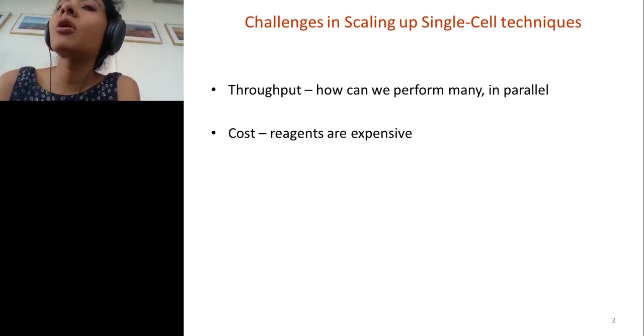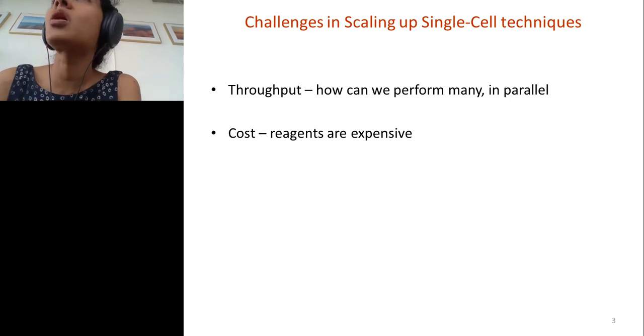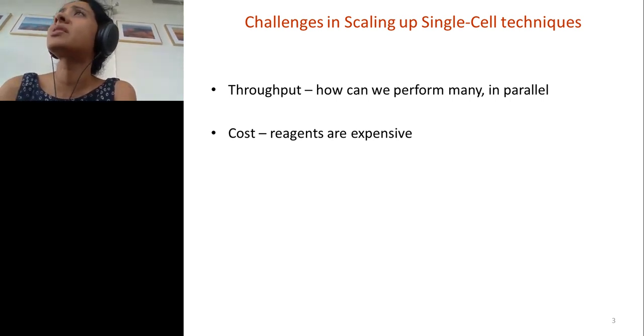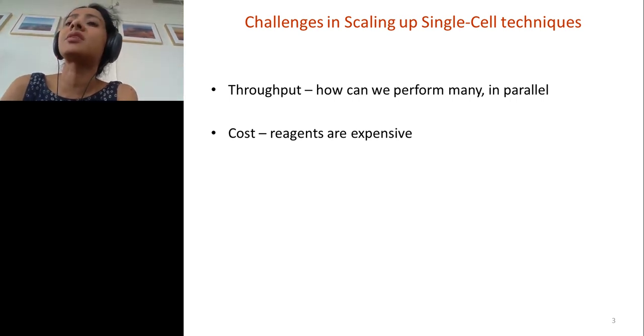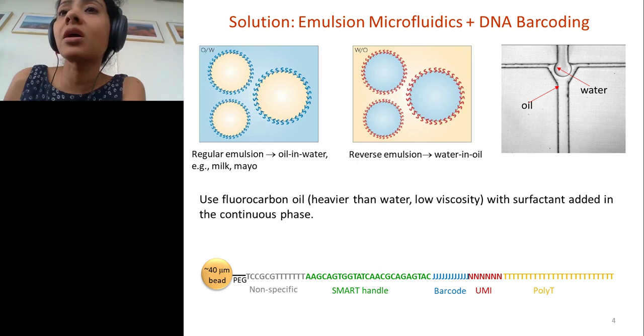We are all aware of the high cost of DNA sequencing, and there is also in parallel a very high cost of preparing these cells for the kind of sequencing that the field does these days. So we had to perform many experiments at the same time and also be cognizant of the cost.